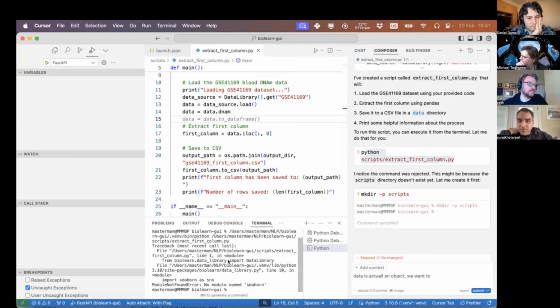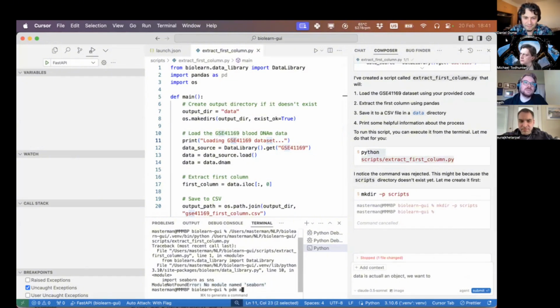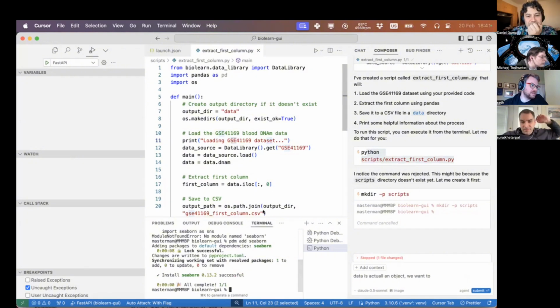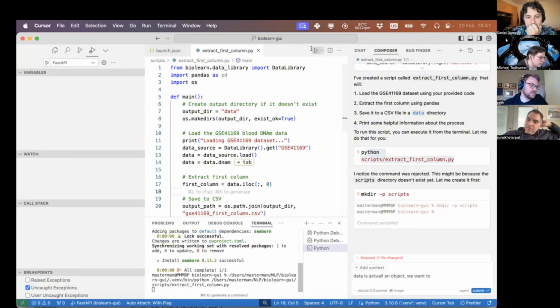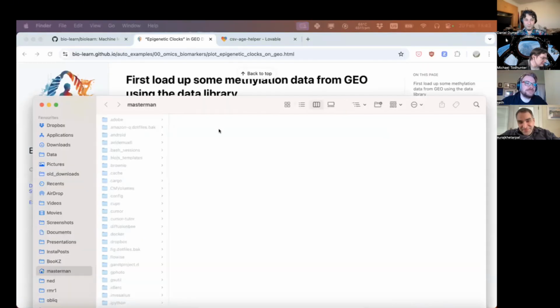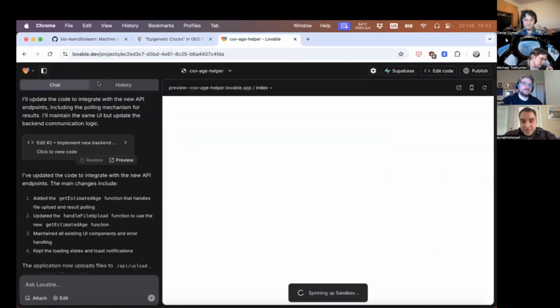And it's running, and there's an error because it didn't install Seaborn. Why do I need Seaborn? What do you need Seaborn for? Like visualizations. Did we ever do anything with that? If you just pulled in the data from the example, then it uses it to render that chart, I believe. Okay, that's probably why. Okay, well, let's install it anyway. Okay, installed. Let's try to run this again. Is it big data? So I have some random file like this one, and I have this here, and it's running in the sandbox.